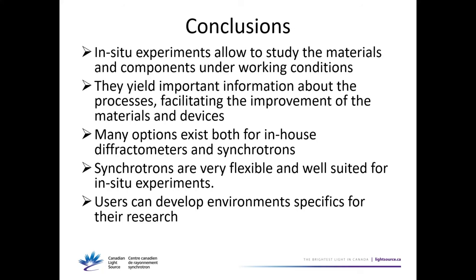All right. So I just want to ask about perhaps the most hated experiment, that is high pressure hydrogenation reaction. Is there any cell designed at the beamline which can do in-situ hydrogenation reaction if I want to look at the absorption of hydrogen over a palladium surface maybe?